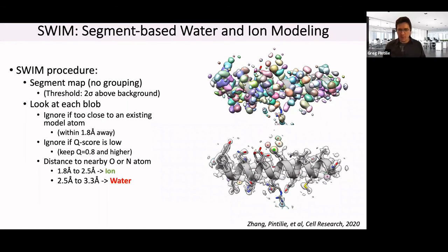Yeah, that's a great question. I went back to this slide because I remember seeing an alternate conformer in this case. You can see this arginine goes off in two different directions here. Indeed, in those areas you start to see that the density looks a bit more noisy, very peaky, with sharp peaks. In that case it doesn't do anything too intelligent. It really just looks at the position of every atom and says this conformer correlates better with the peaks, and the peaks look more atom-like than in this conformer. So you can use that to pick which conformer is more resolved than the other.